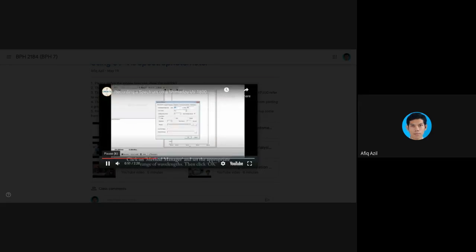Now what he is doing is the blank correction reading, or sometimes also known as baseline correction. For this version, unlike the previous video, where you have to twist the knob and the measurement has to be done at one particular wavelength at a time, using this double beam spectrophotometer, a slightly advanced version, you can straight away do a range. A range means, let's say, 400 to 800, or maybe 300 to 700, instead of doing 300 first, then 310, 320, 330, and so on until you reach 700. That will take a longer time.